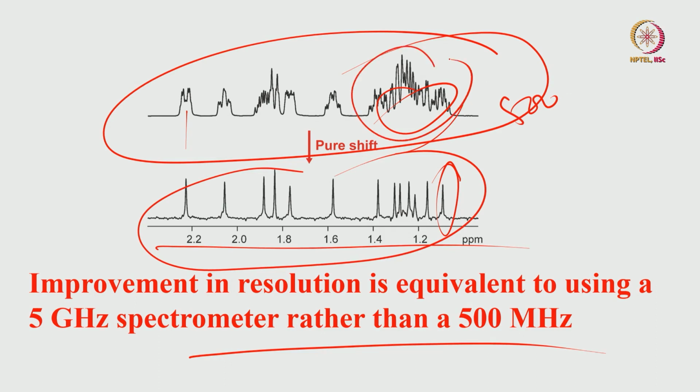If you obtain this spectrum at 5 gigahertz, you get this type of resolution. You can imagine it like that. It is a comparison. All right.